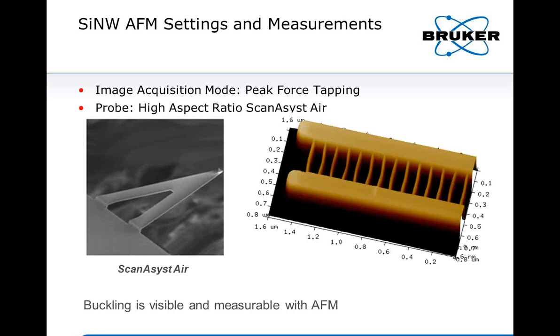The AFM was then used to characterize the same silicon nanowires measured by the SEM. Feature co-location was performed by an XML recipe exchange between the Insight 3D AFM and the CD-SEM. It was quickly determined, however, that the resonant-based feedback of CD mode would not provide sufficient and immediate force control in order to be able to measure the delicate silicon nanowires without disturbing them. In order to be able to image the silicon nanowires, the precision force control of PeakForce Tapping was required.